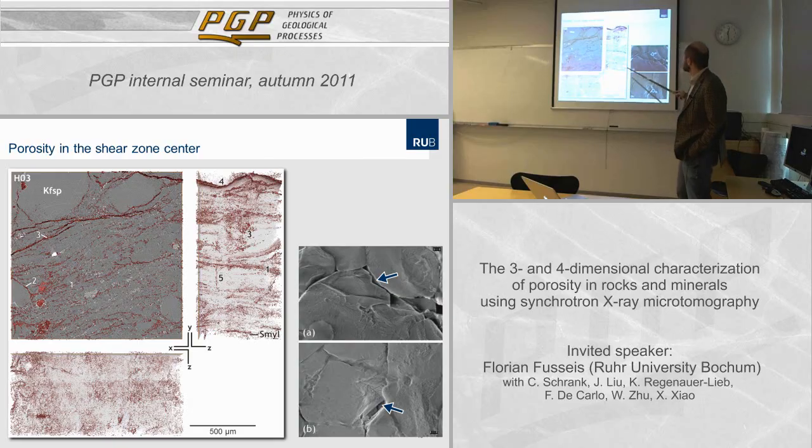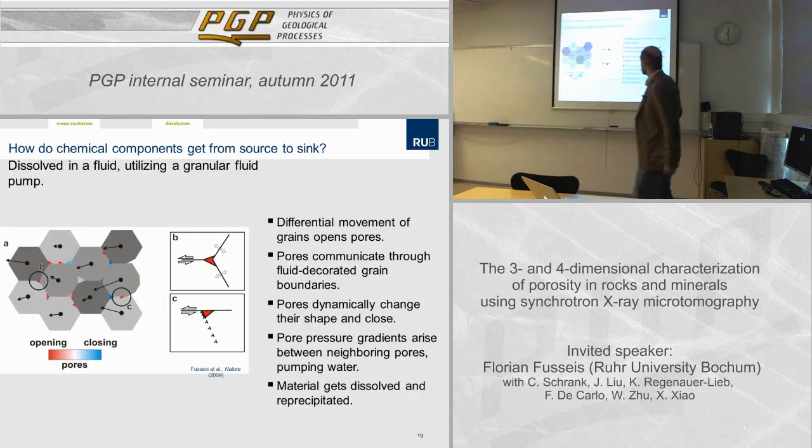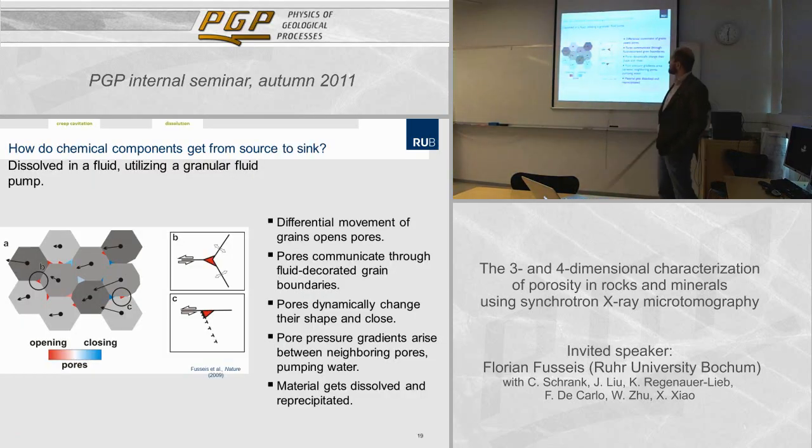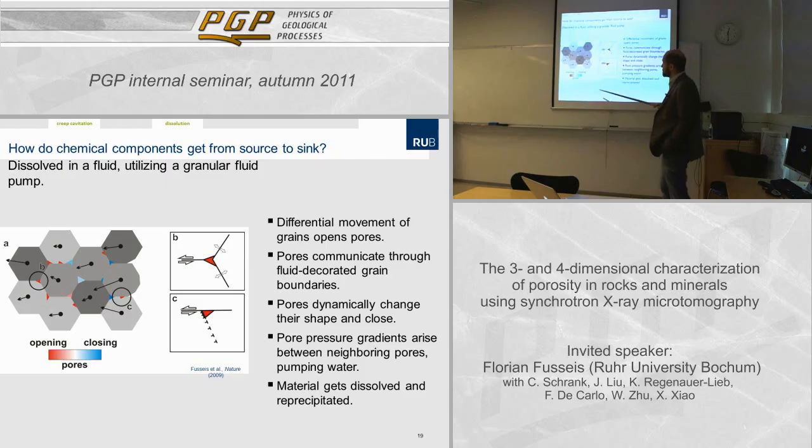If we split that sample open and look at it again in the scanning electron micrograph, and these are now 200 nanometer scale bars, very high resolution, we can see some of these pores. They're actually grain boundary cavities, and we find that these incisions indicate that material dissolution was heavily involved in their creation. There's another process that we claim was involved in their creation, a process called creep cavitation, and we know that process from metals and ceramics. They deform by this process, which is active during the deformation of metals under certain conditions.